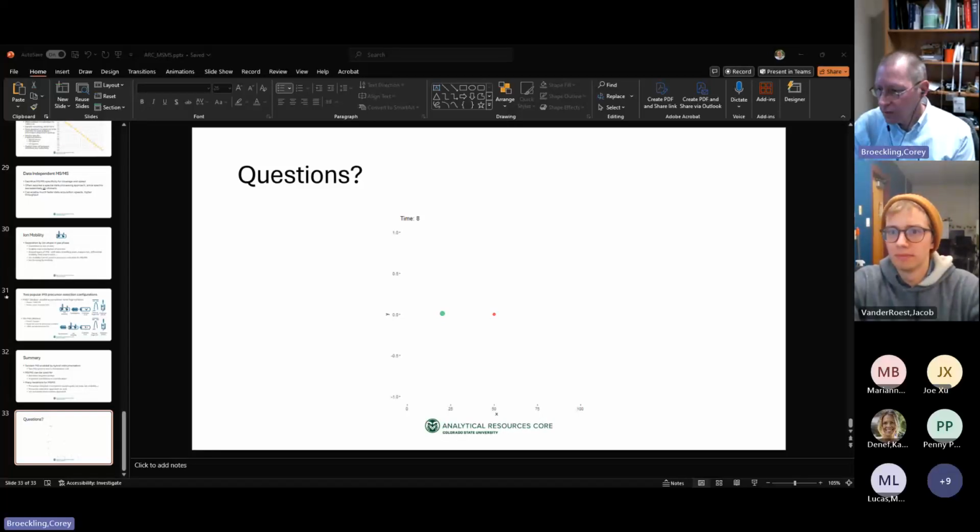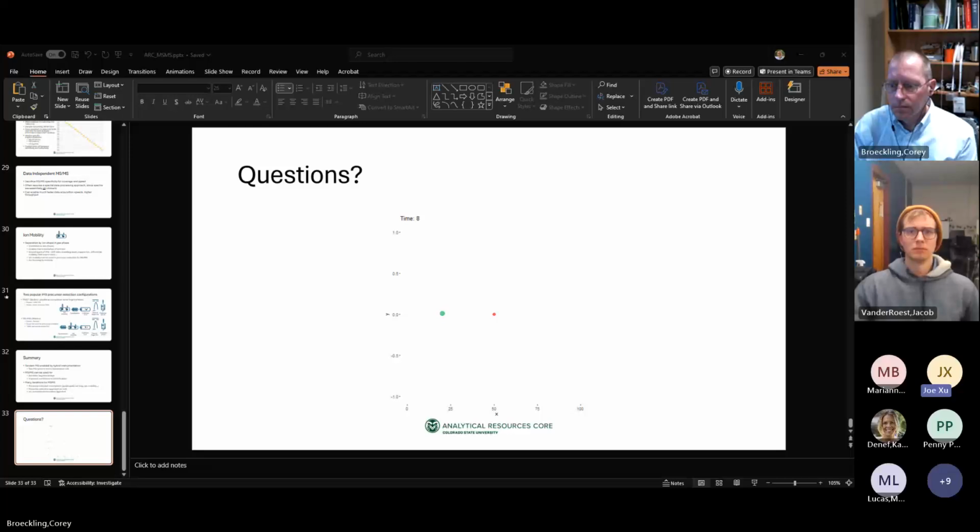I see a question from Joe. Hand up. Hey, Corey. Yeah, thank you for the great presentation. I have one question about the differences between QTOF and Orbitrap on the untargeted precursor screening. So do you think you can give us some kind of general information about the pros and cons for these two types of instruments on the untargeted precursor selection? They're actually not that different.